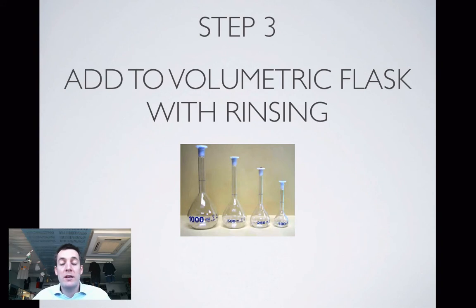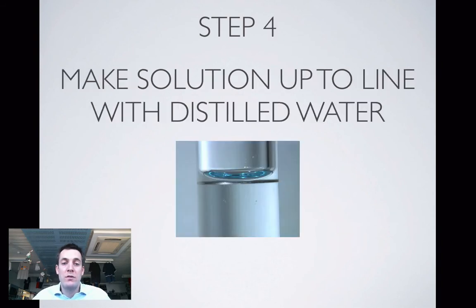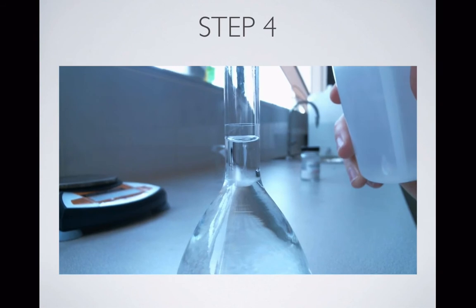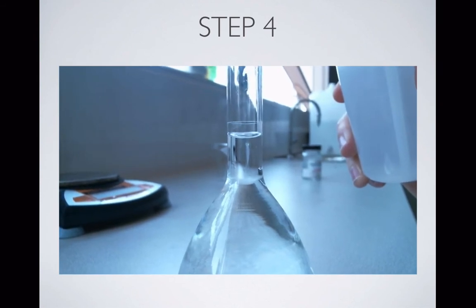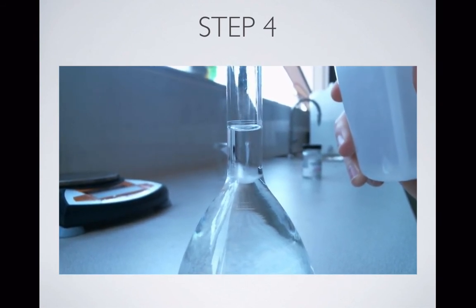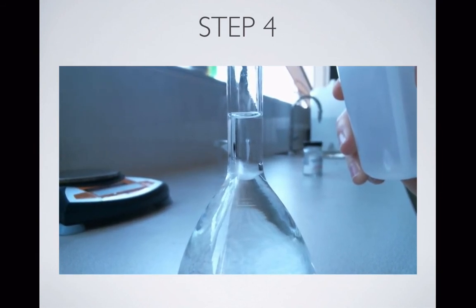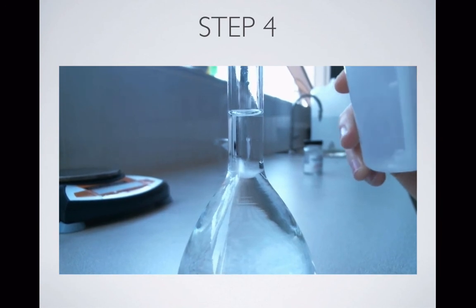And then we're going to add distilled water to our volumetric flask up to the line that we can see on the flask. Then we'll make sure that we've got a certain volume of solution. So this is called making the solution up. All volumetric flasks will have a line on their neck. What we're trying to do here is really carefully top up our solution with the distilled water exactly to the line, meaning the bottom of the meniscus is resting on the top of the line.